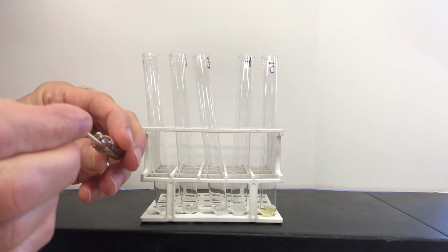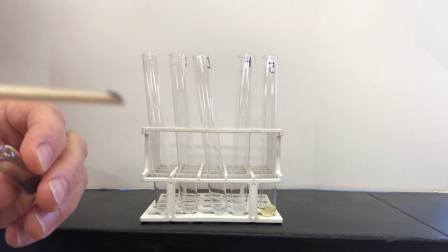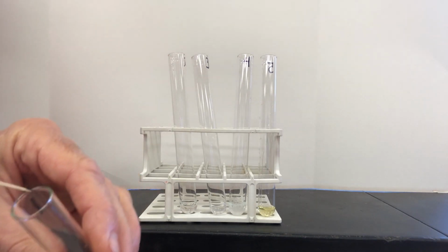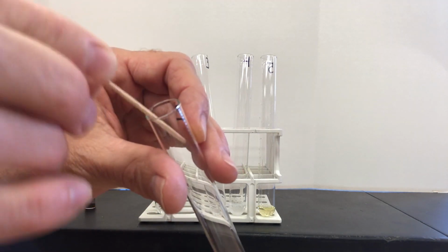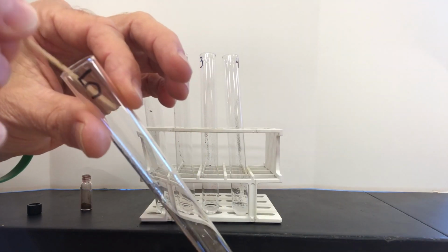To your 5 clean test tubes, you'll add 1 milliliter of the known samples to each of the appropriate tubes. Next, using a toothpick as a scoop, get a small quantity of the oil red O powder on the end of the toothpick. Carefully dump this into the sample, starting with tube number 1. Make sure all of the powder moves down to the liquid and then swirl. Repeat this for the other 4 tubes.